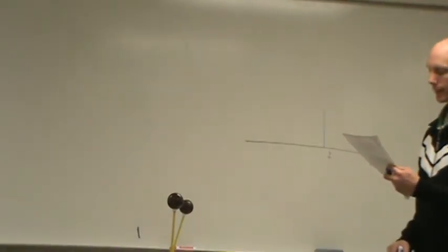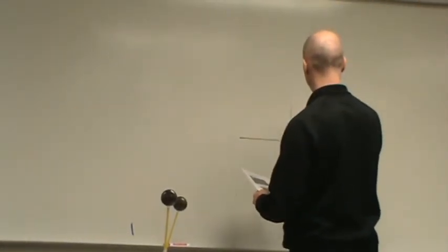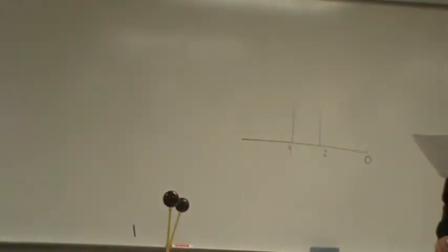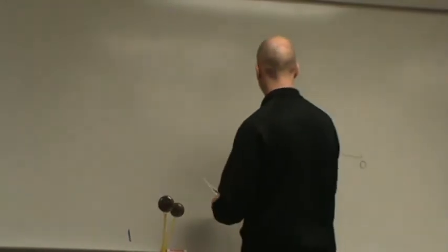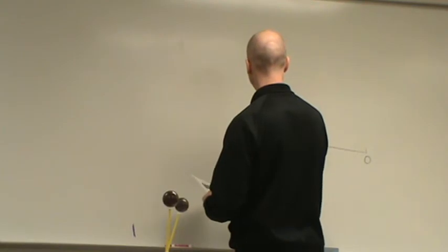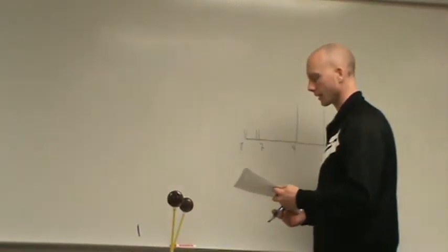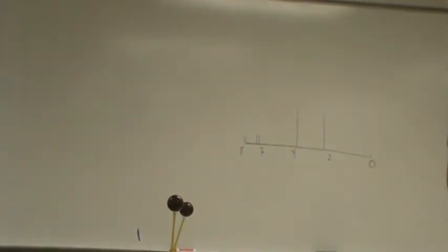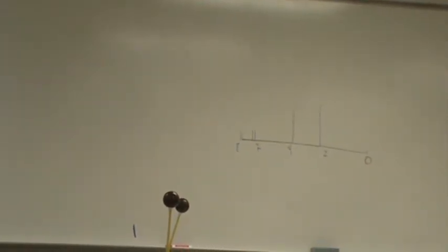Okay, 1 is a little bit above 2. Looks like that's a singlet. Okay, and we have 1 just before 4, at about 3.8. And then what do we have between 7 and 8? What does that look like? 2 doublets. Okay, so that's kind of a sketch of what we're looking at. Okay?